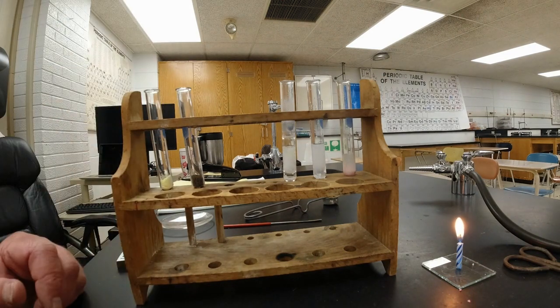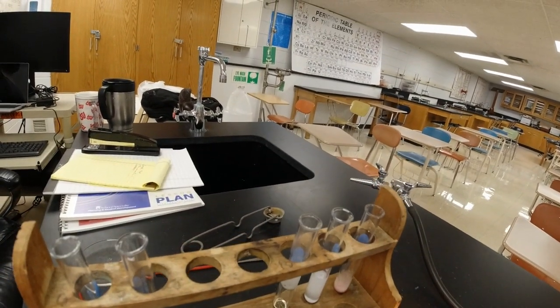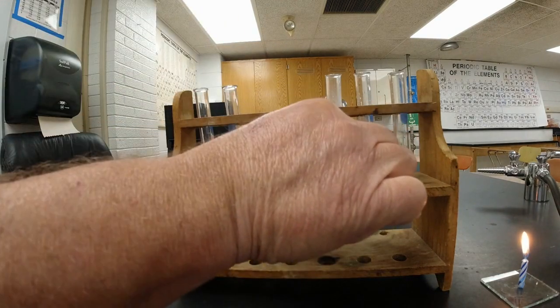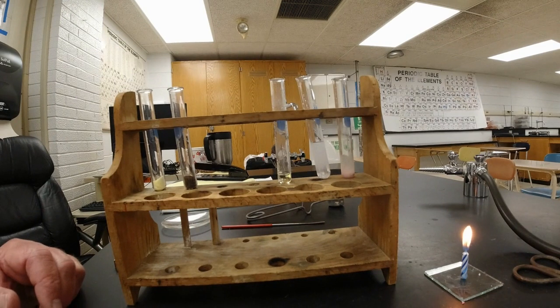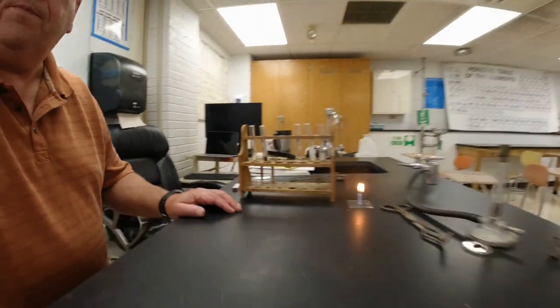I see steam coming from the top of it. I don't know if you guys can see that or not, but there's steam coming from the top of that test tube. And if I were to touch that test tube, wow, it's hot enough to burn my fingers. It's really hot, all right? So there is tearing the magnesium, and there was putting acid on the magnesium. Okay, if you need to pause and write some things down, do that.